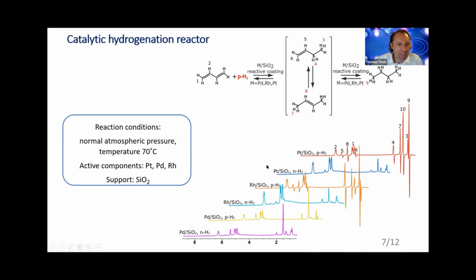So the next question is, can the products diffuse back through the capillary? And if they diffuse back, is there a possibility that the downstream catalyst would be interacting with partial hydrogenation products produced from the previous platinum reaction? We proved that diffusion through the capillary didn't exist. Alexandra said we performed the experiments with a Teflon tube and proved that they're not diffusing down the tube.